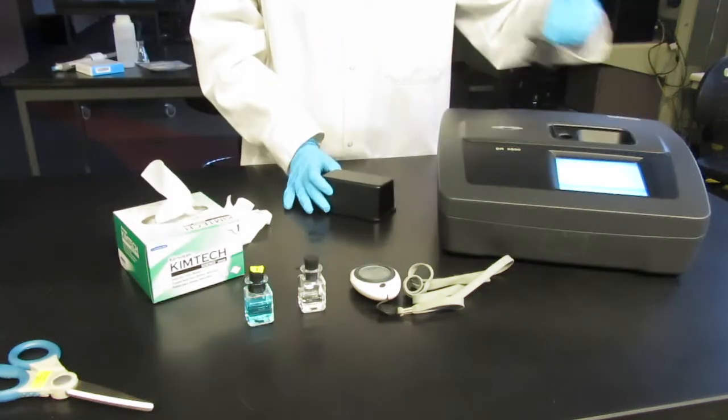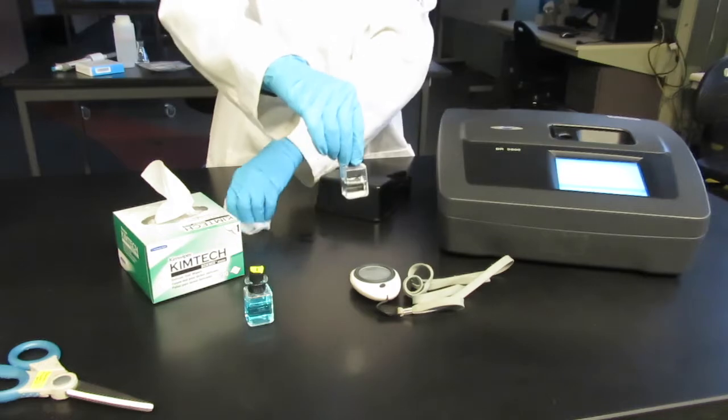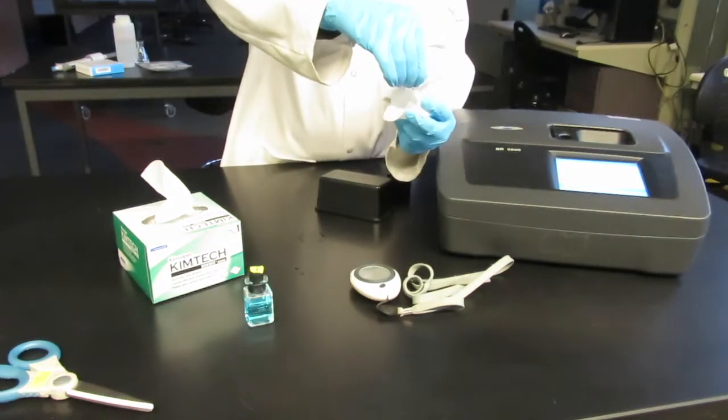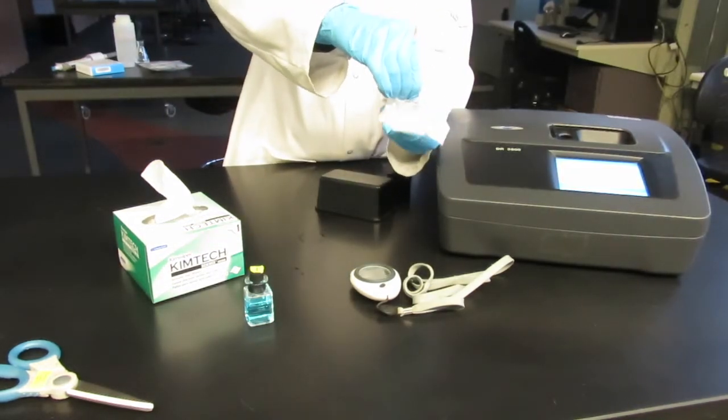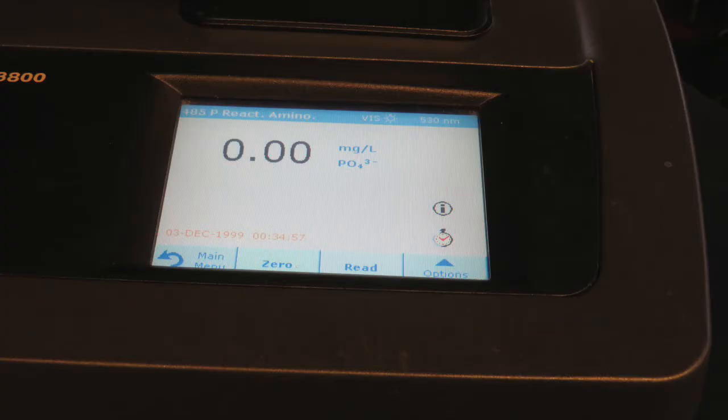After two minutes use a kim wipe to wipe your blank cuvette by holding the lip of the cuvette. Insert into the cell holder and place the light shield. Press zero to zero the instrument.